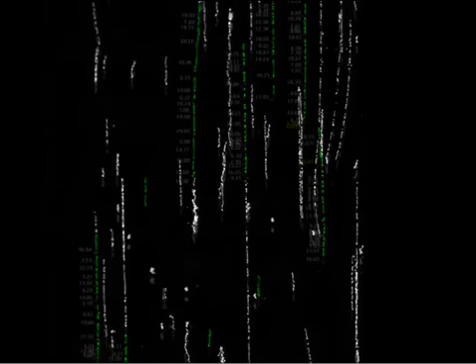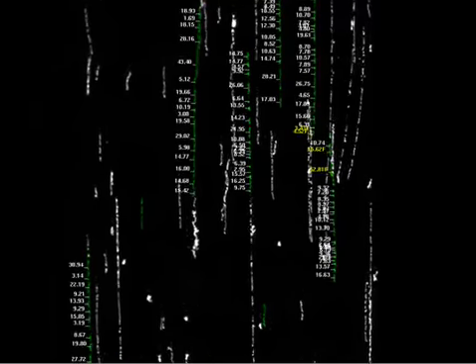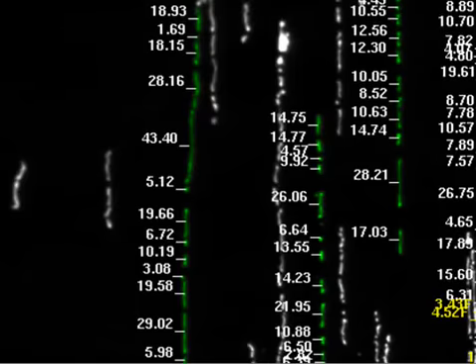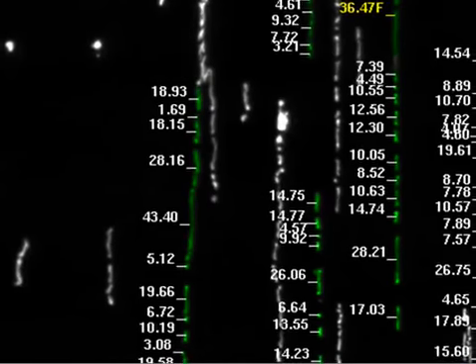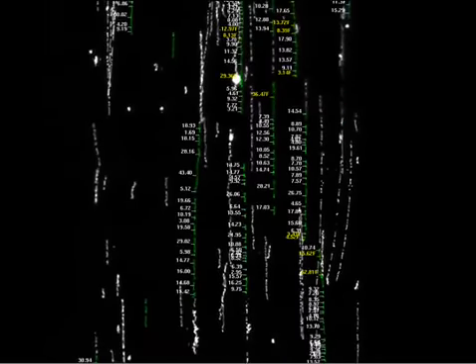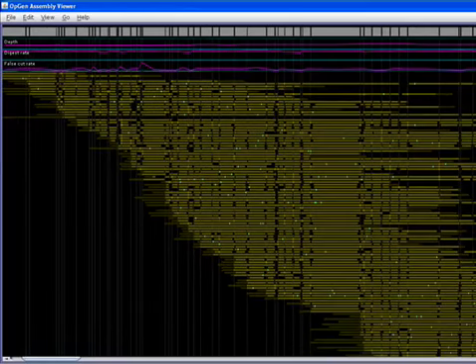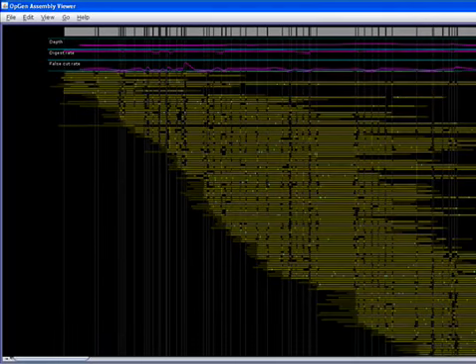The Opgen system then marks up a subset of molecules to annotate and labels them in green. The system assesses the size of each DNA fragment of each of the marked up molecules and labels each fragment with its size in kilobases. These are single molecule maps, and this information is specific to the organism that the DNA originated from and is called the map code. The unique map code of all the single molecule maps are compared to each other to find overlapping regions. The single molecule maps are then assembled together to tile across the entire genome.